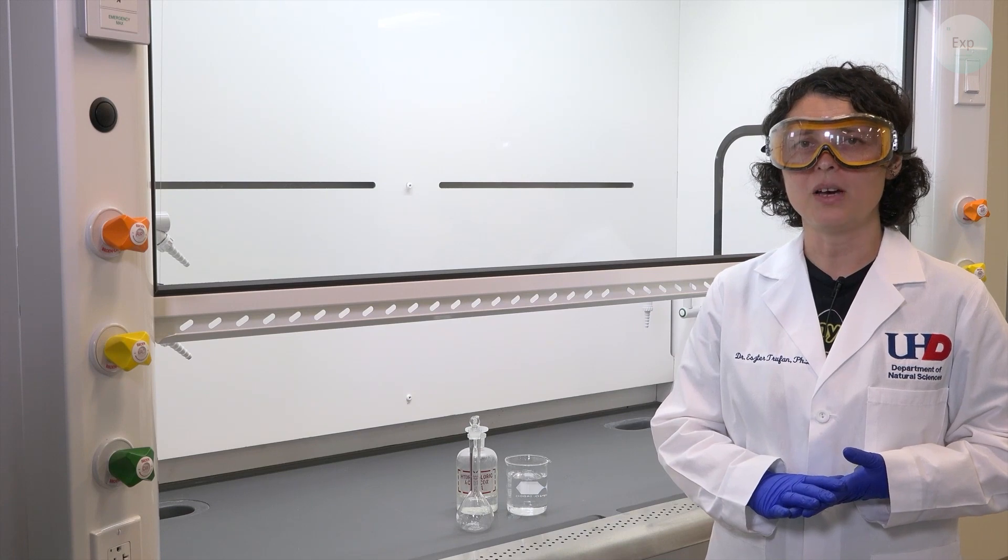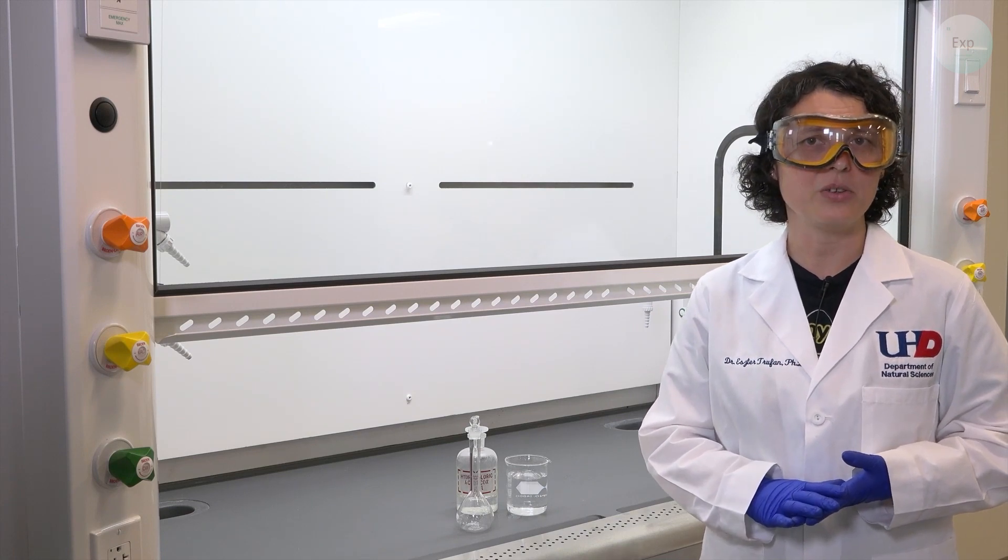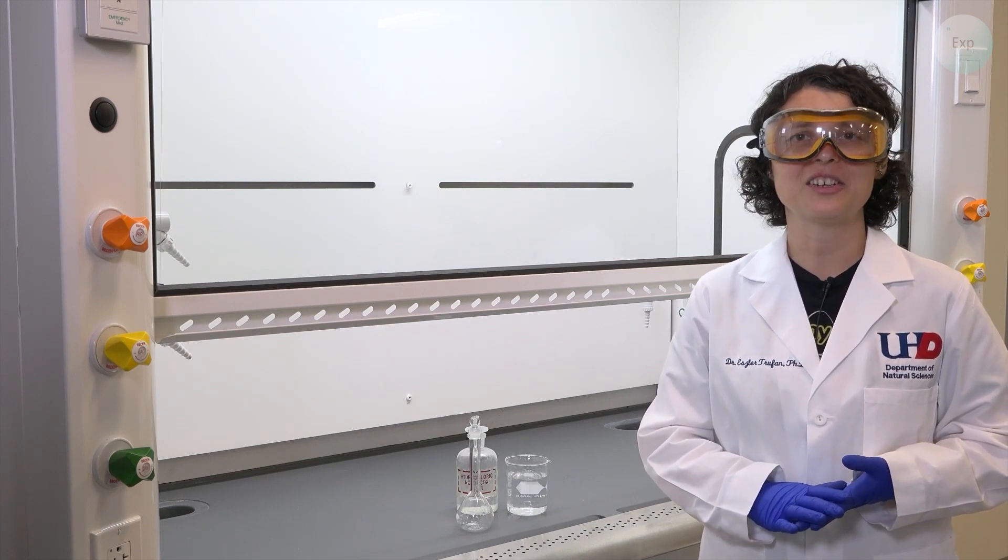We need to know the exact volume of concentrated hydrochloric acid that we're using, so we will need a 10 milliliter graduated cylinder.